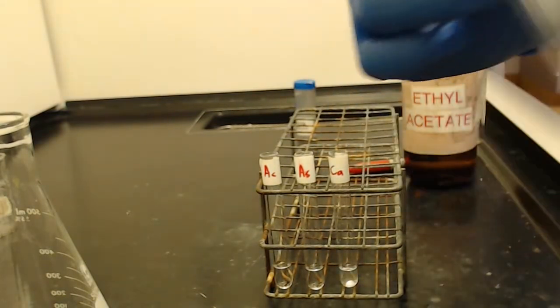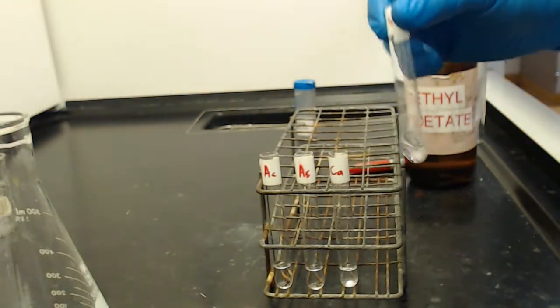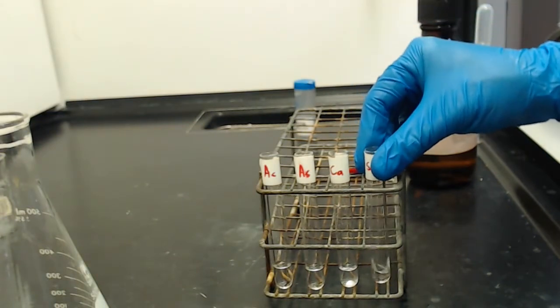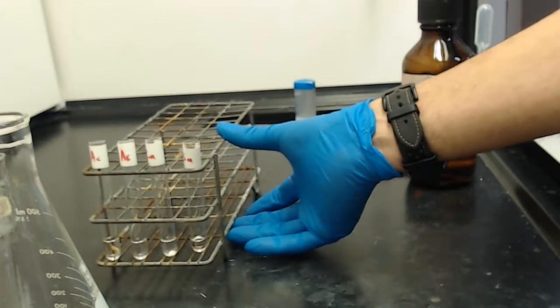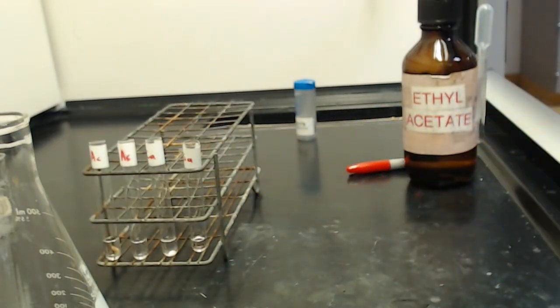All right, so that was the caffeine. Here we have the salicylamide. Okay, all the samples are ready to go. I'm going to go ahead and set these aside for now. The solvent should not evaporate too quickly.